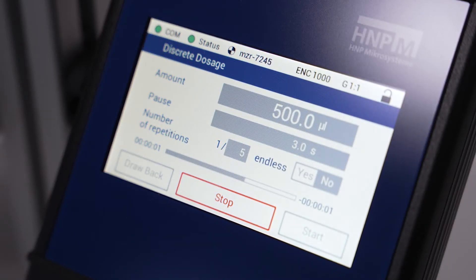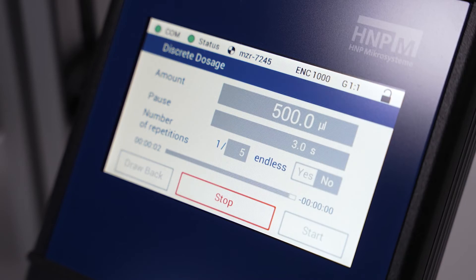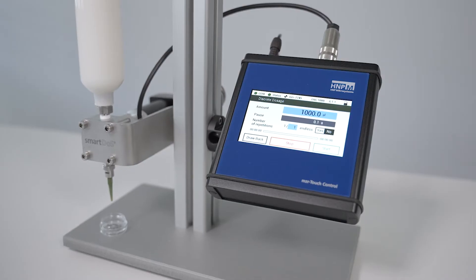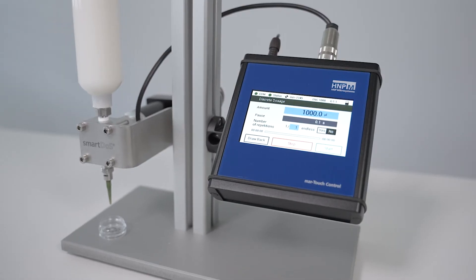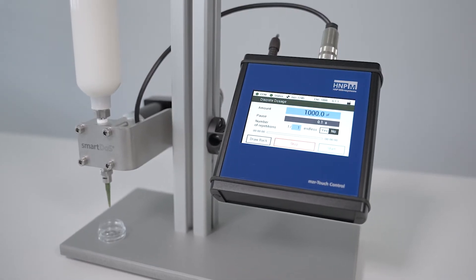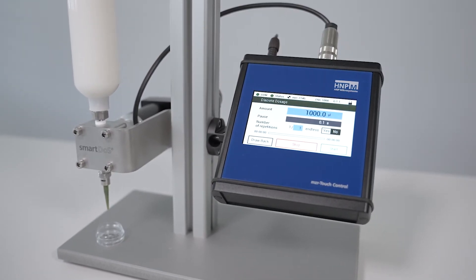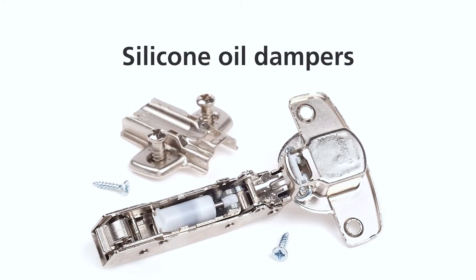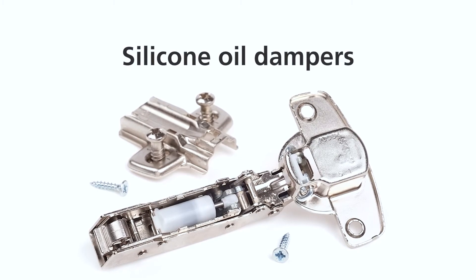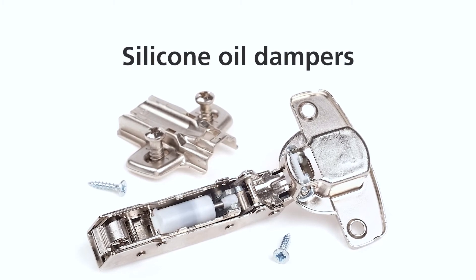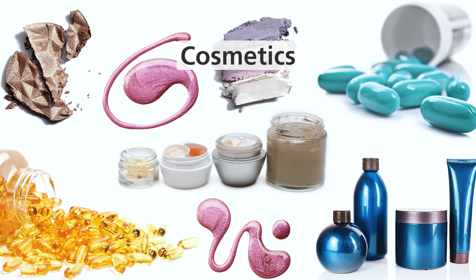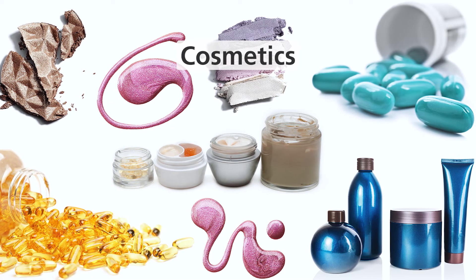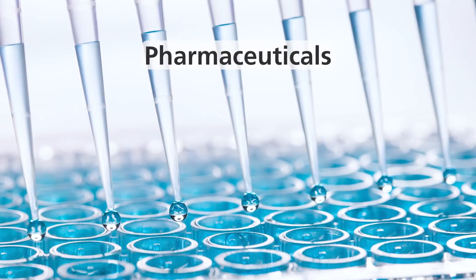The SmartDose is used both in stand-alone operation and in semi or fully automatic systems, for example for bubble-free filling of silicone oil dampers and for filling in cosmetics and pharmaceuticals.